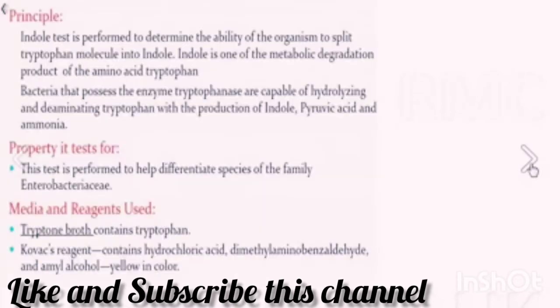Indole test. Indole test is performed to determine the ability of the organism to split tryptophan molecule into indole. Indole is one of the metabolic degradation products of amino acid tryptophan. Bacteria that possess the enzyme tryptophanase are capable of hydrolyzing and deaminating tryptophan with the production of indole, pyruvic acid and ammonia.